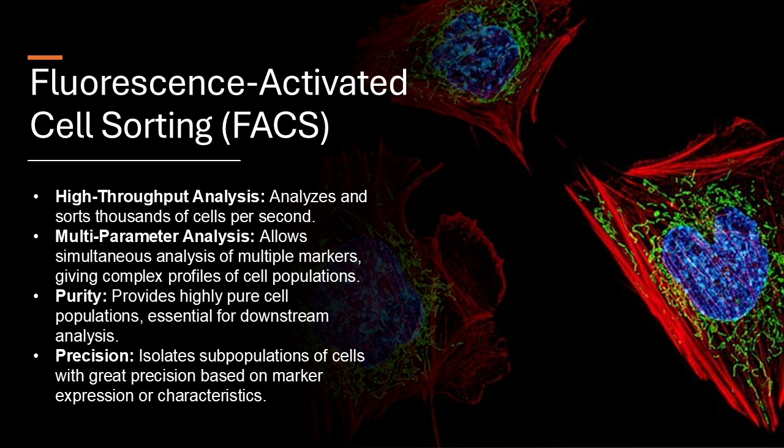Yeah, exactly. And it's not just cancer. FACS is also a key player in stem cell research. Wow. It's used to isolate stem cells from various sources. Bone marrow, umbilical cord blood, things like that. This is so important for developing stem cell therapies, for spinal cord injuries, heart disease, the whole thing. Stem cell research has so much promise. It's fascinating to hear how FACS is contributing to that. It seems like this technology is leading to all these breakthroughs in medicine.